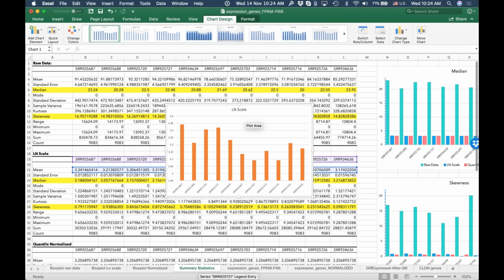We are expecting various genes to change their expression. So maybe some will be higher, some will be lower, and those groups would be different between two groups. Not overall, all of our gene expression to be suppressed. And so because of this, we now want to normalize the data. That would be the rationale for trying to do that.